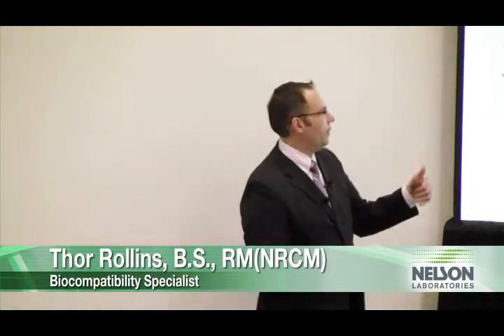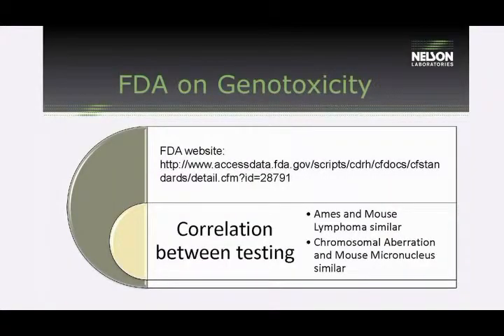And no one in the industry had a good size determination. When is a colony small and when's it large? So most of us were just going, well, we had this much size, you guys determine what it is. And so there wasn't this good consensus information as far as the size of the mouse lymphoma colonies. So the FDA released its own guidance document, okay?